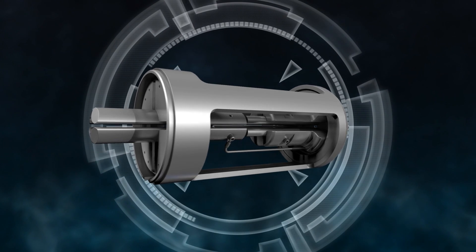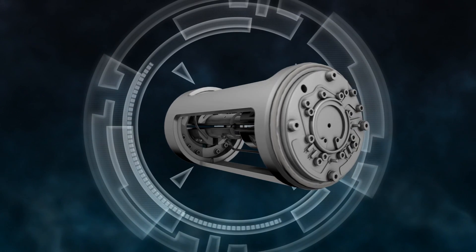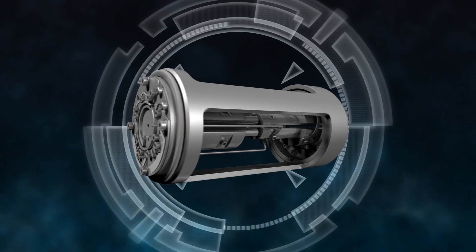the new Ion drive Q-Jet guide improves sensitivity through its dual-stage design, which improves ion capture rates and focuses ions more efficiently than ion funnel approaches.